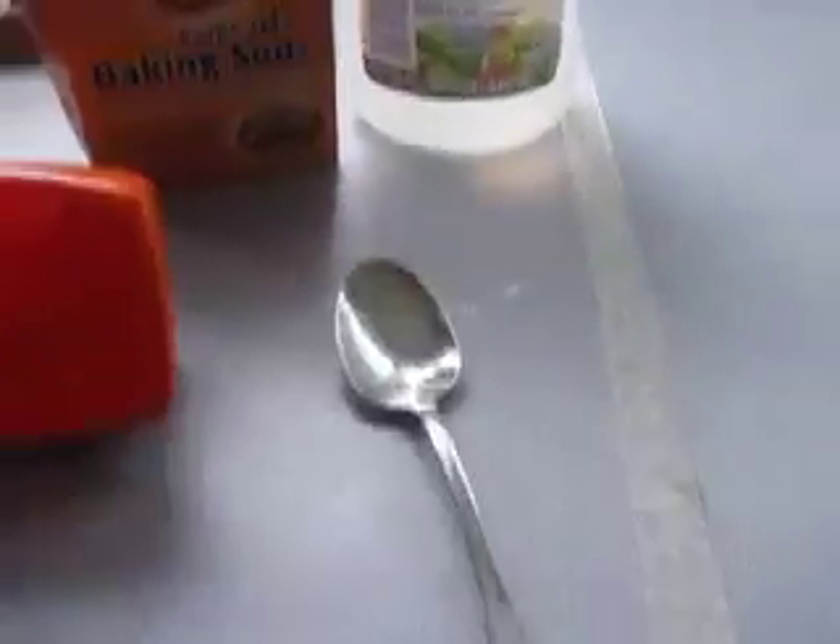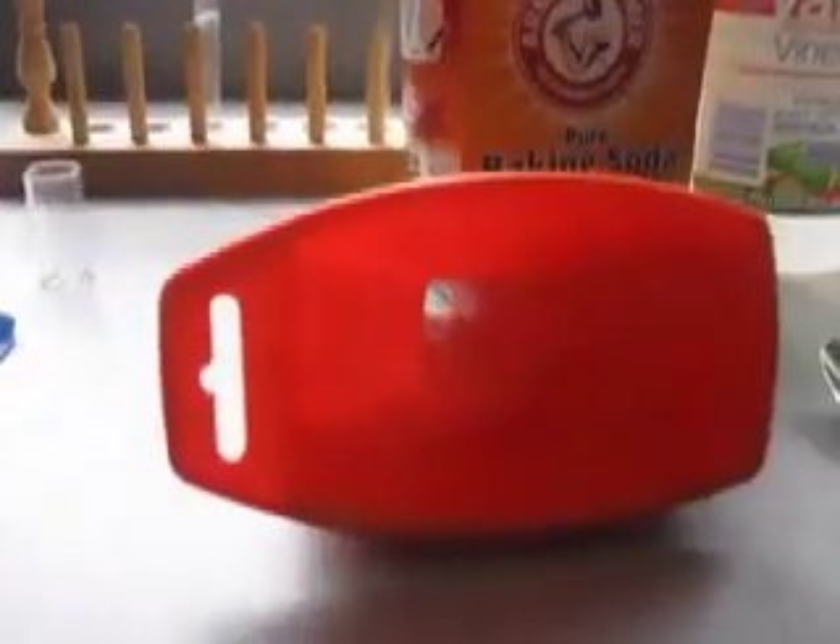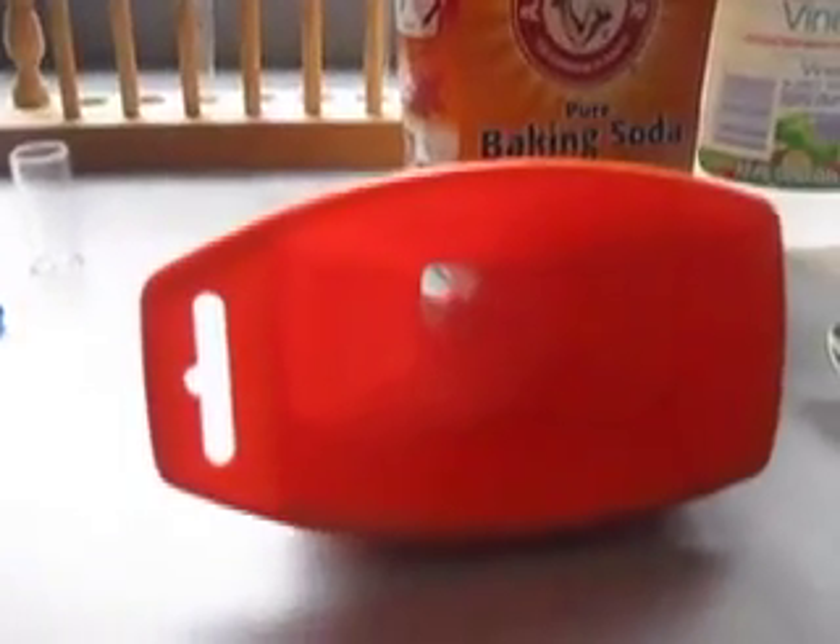And then we have this really fancy scientific equipment called a spoon. And then we have this funnel. So I will demonstrate to you what we will do with these things.